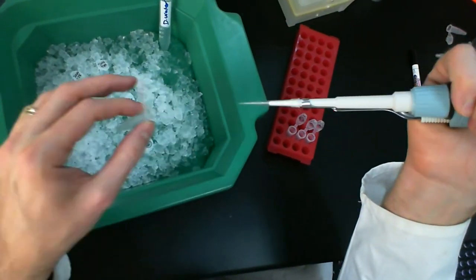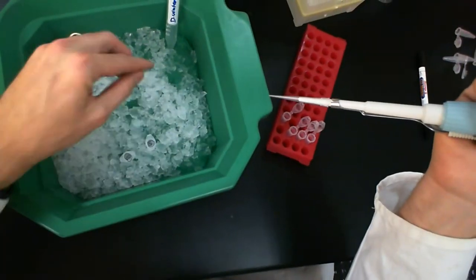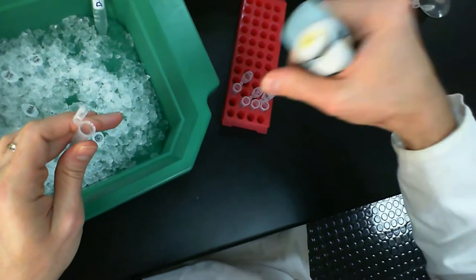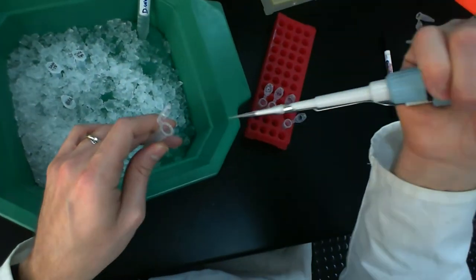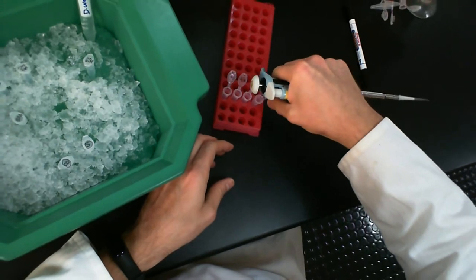Again, I'm doing this because it's the same buffer for all tubes, and so it doesn't really matter if I change my tip or not. I don't have to change my tip here because it's just going into clean water. So I'm just going to add this to tube number 2. Move that one over. Tube number 3, move that one over, and tube number 4. It's all the exact same buffer. Again, there's a reason why I chose to use these specific enzymes, because they do have a compatible buffer.